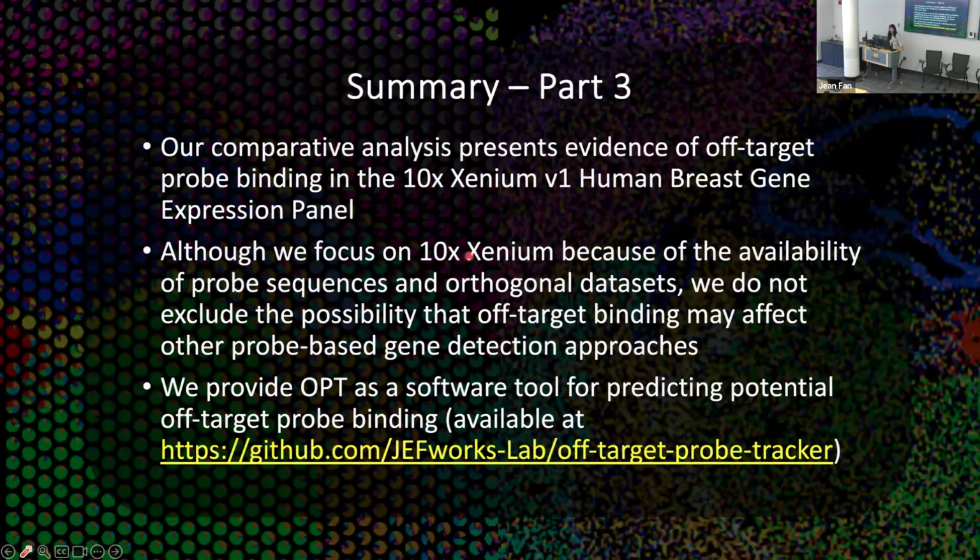And even though here we did focus on 10x because of the availability of their probe sequences, there are other companies that don't make their probe sequences available, so we weren't able to interrogate this. But also, there were these orthogonal data sets that we were able to integrate to substantiate our predictions. So we don't exclude the possibility that this off-target probe binding might affect other probe-based detection approaches. And finally, we provide this OPT software as a tool that we encourage you to try out and apply to your own data sets and technologies of interest.